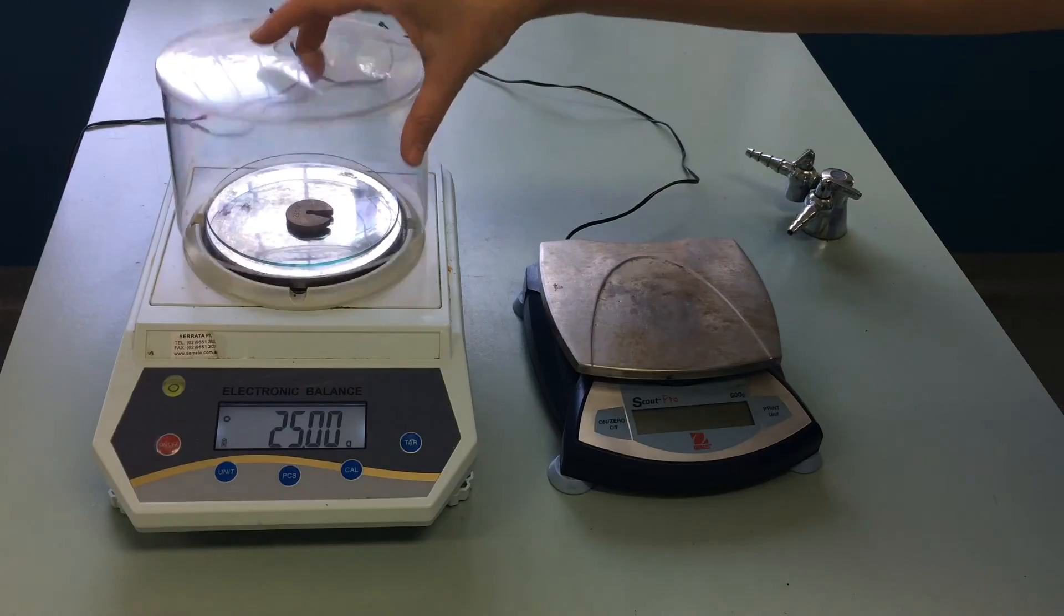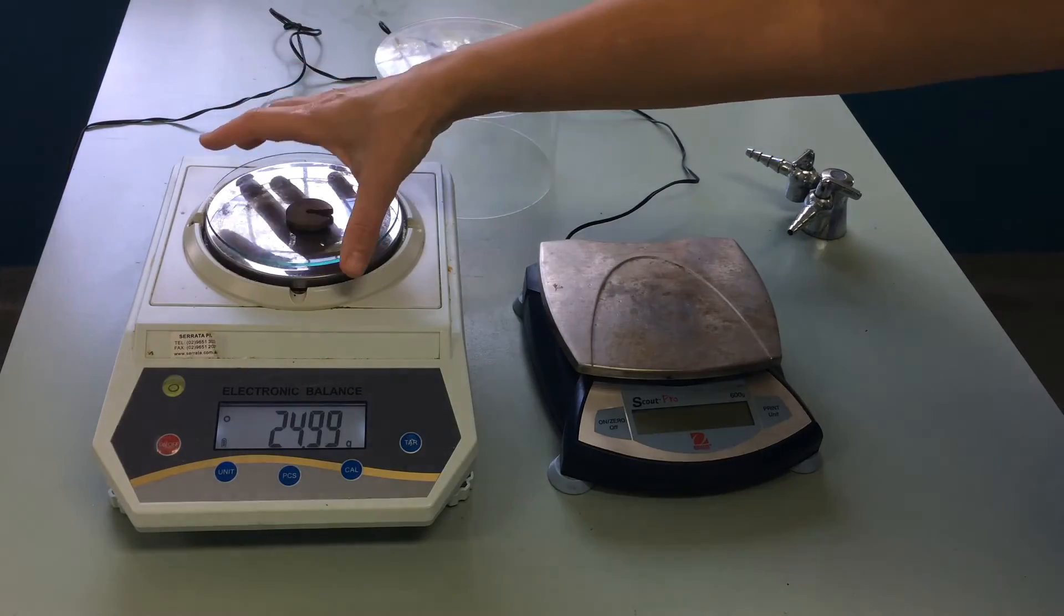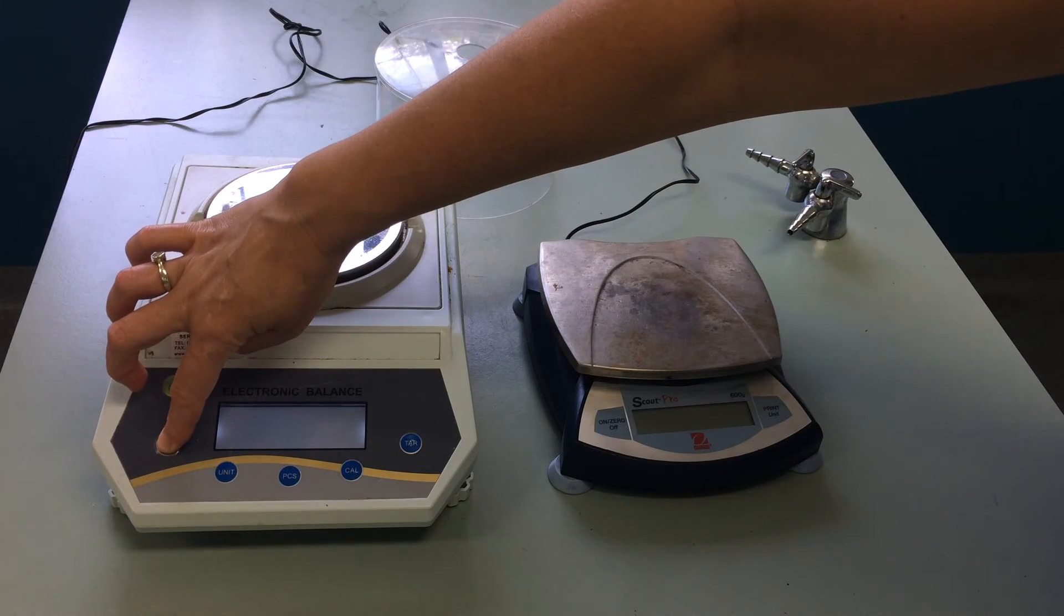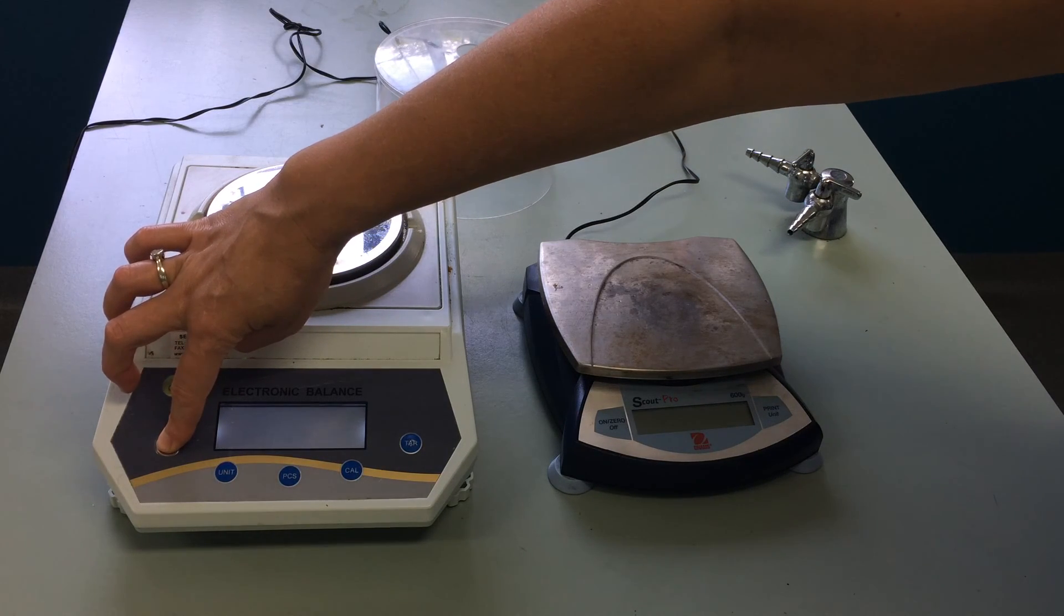When you're finished, take the object you've weighed off and then simply turn the balance off using the on-off button or the switch. Thank you.